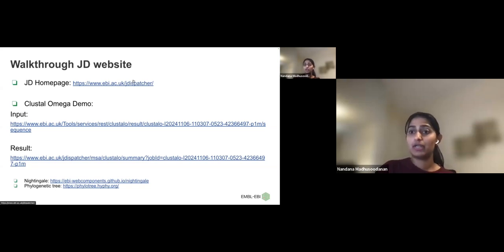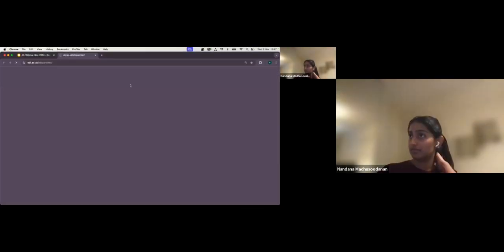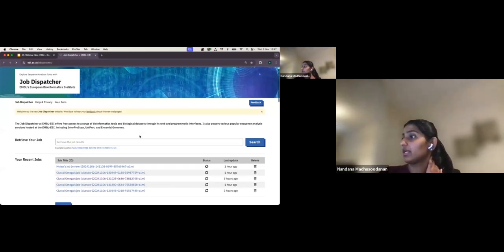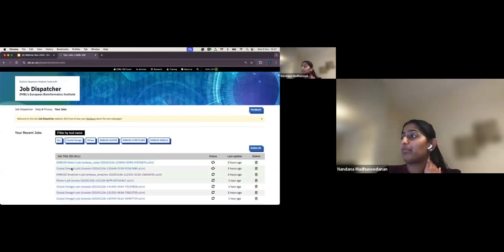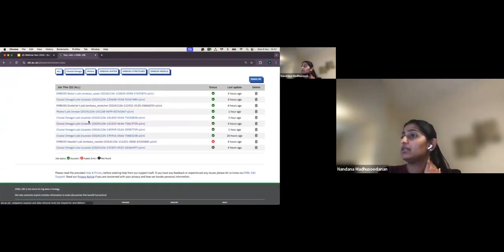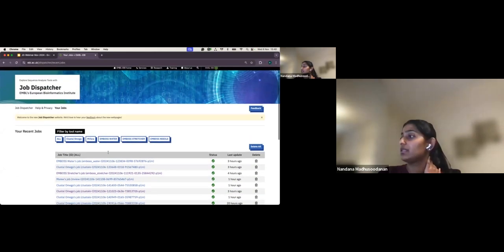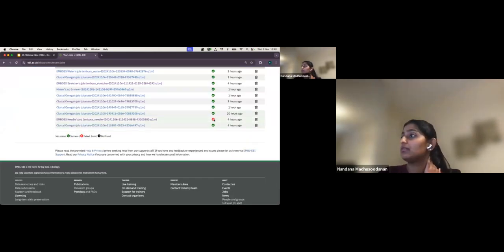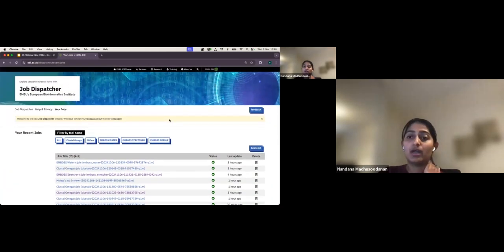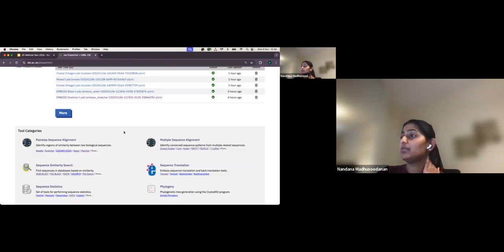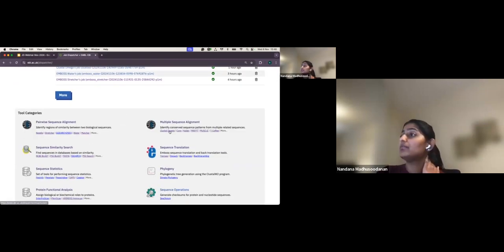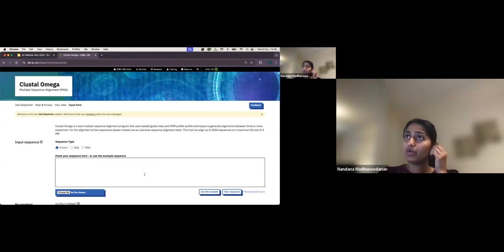Let me now go to the Job Dispatcher website for a live demo. I can see jobs I've already run here. I'll show you a Clustal Omega example, partly because I'll also be showing the same tool for the programmatic access demo.